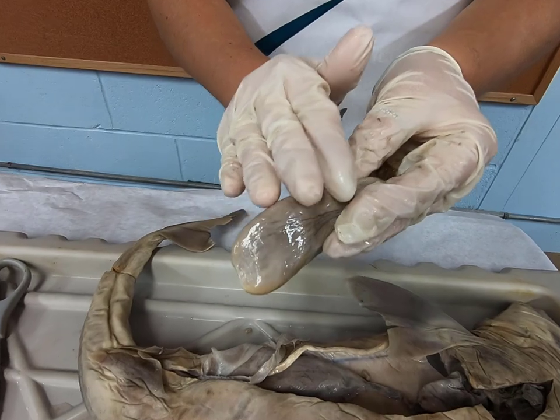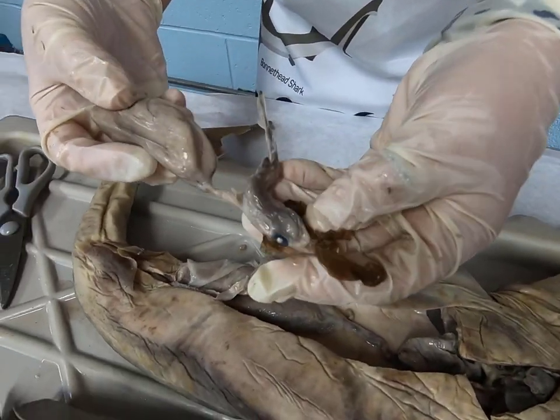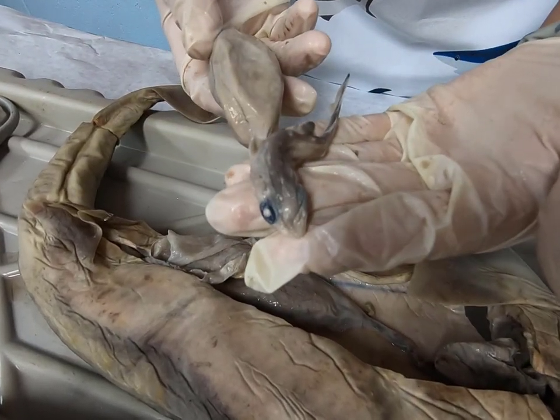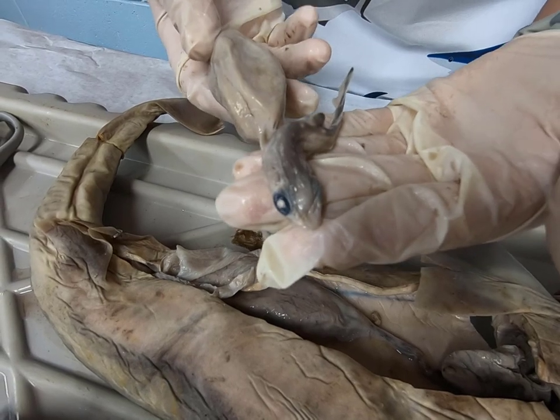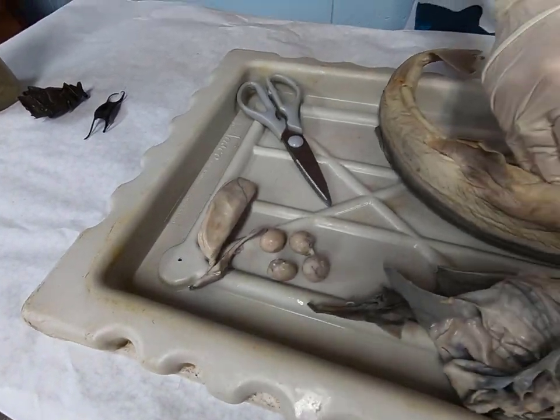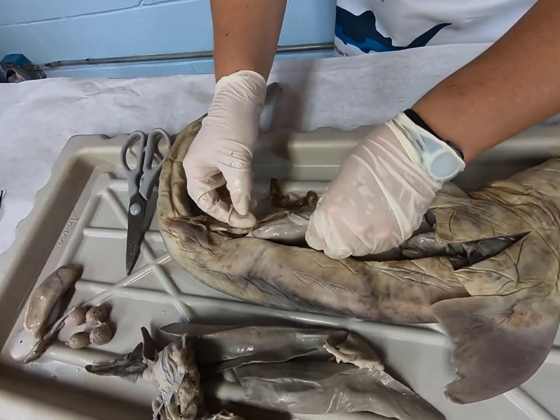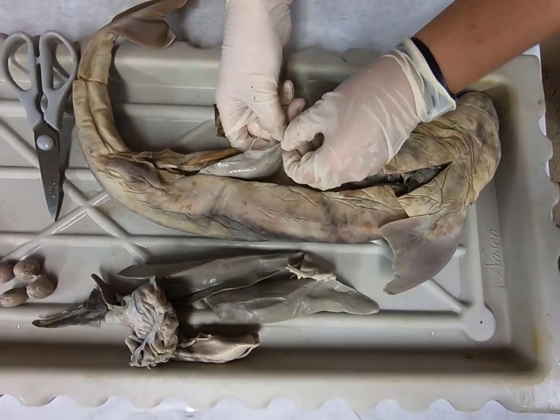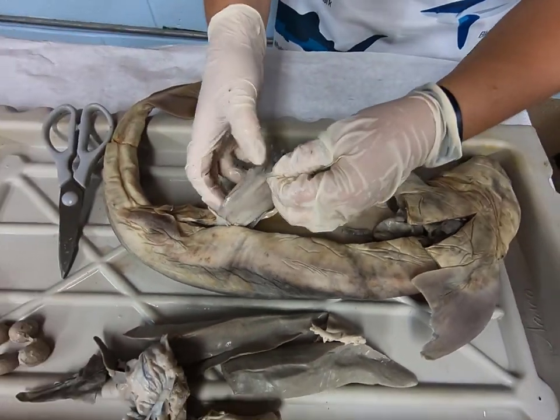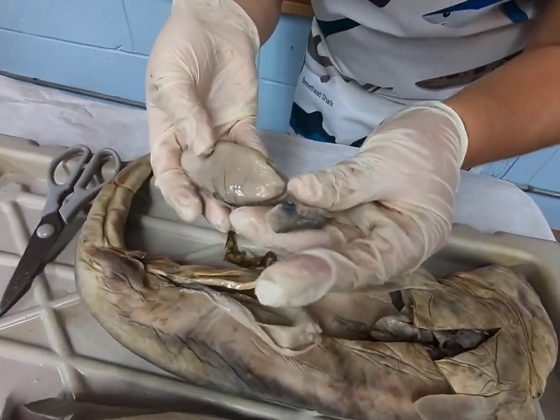So this right here is our yolk sac. And this is our developing baby shark. Right here. So we have one. And let's open the other uterus. And here we go, there's another.